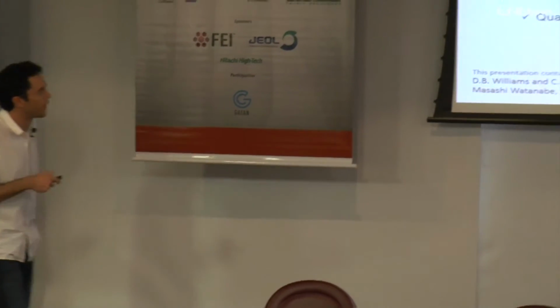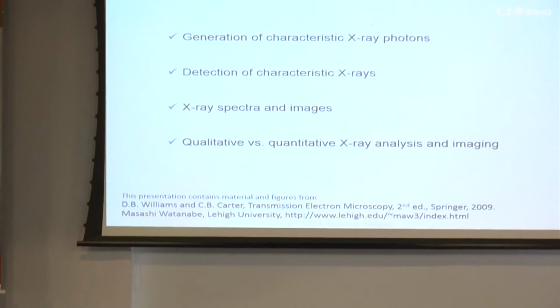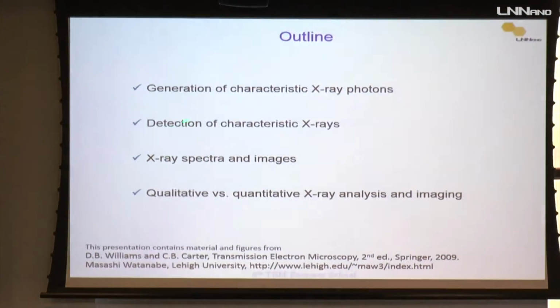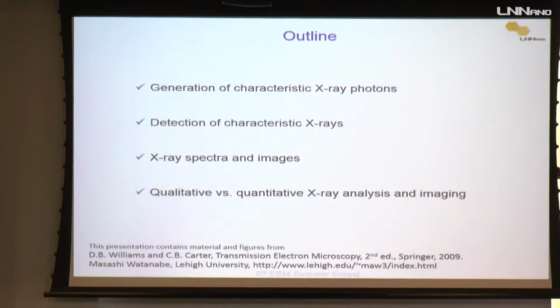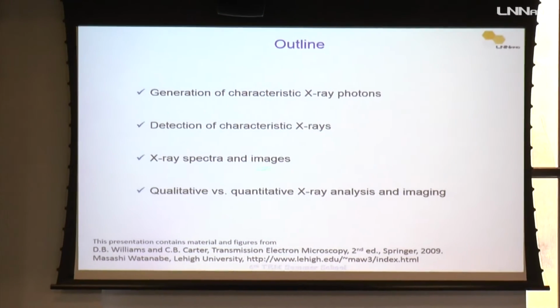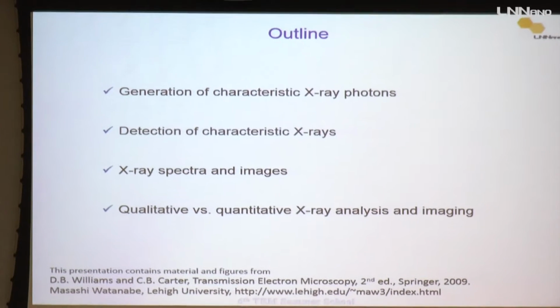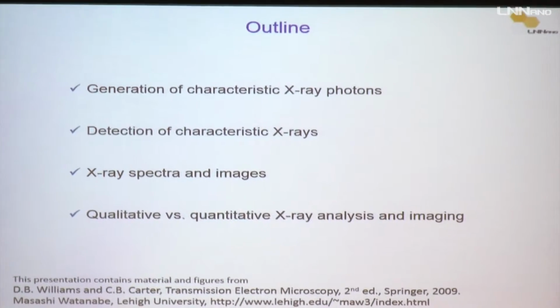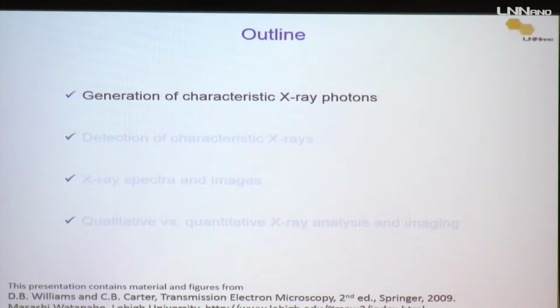Well, the outline of my presentation is: I will talk about the generation of characteristic X-ray photons, the detection of these photons, okay? I will talk about X-ray spectra and images, and a little bit about the qualitative information that you can get and the quantitative information, the difficulties that you have, and so on, okay?